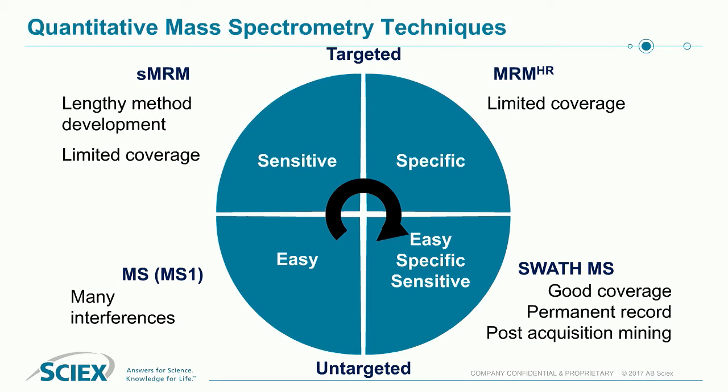What we're focusing on is really to use our SWATH-MS methodology. This is a method which allows us to quantify essentially all proteins which are accessible, or peptides which are accessible to the mass spectrometer. These are peptides which are within the mass range that we're analyzing, as well as those which are ionized and are detectable by the mass spectrometer. This allows good coverage, but doesn't allow the same sensitivity as the scheduled MRM assay, but allows you to quantify many thousands of peptides and many thousands of proteins.